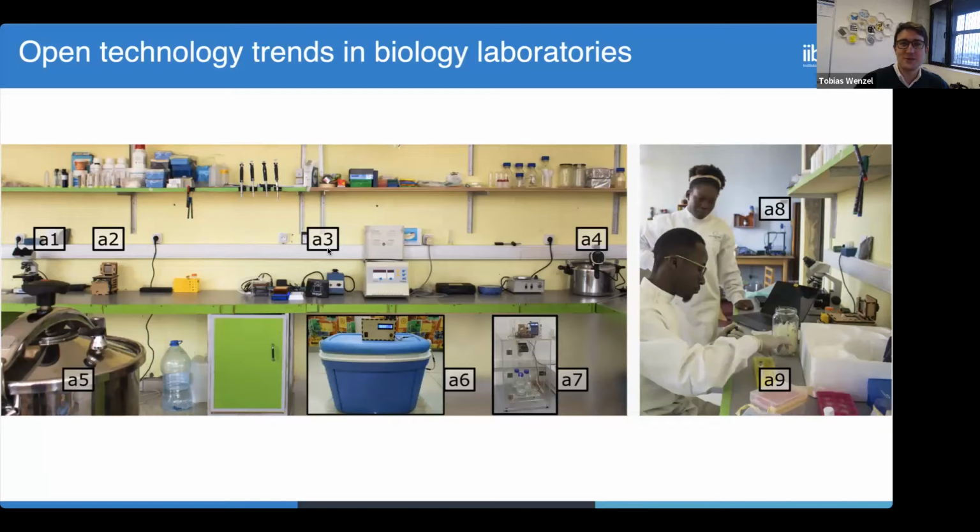So most people have 1 or 2 pieces in their lab, and the rest is a mix usually, and especially in low resource environments, I observe that there's a lot of reused equipment you inherited from someone, or old equipment. And then you have some new equipment that's either cheap or you got an equipment grant, for example, to get it. And then there's some self-built equipment. But there's increasingly also some examples like our lab and this one that really make open source a strategy, and they have a lot of open source hardware equipment.